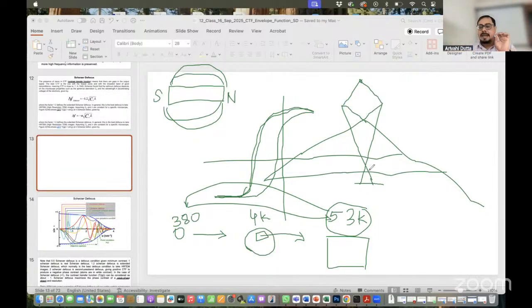Then what is happening? Your one crossover point is here. Your magnetic field is very low. Suddenly your magnetic field is very strong. Again, you are going down. So with these changes, you cannot follow the same pathway. That ferromagnet cannot behave in the same way. So what is happening? That is the lens hysteresis. Now that thing will be embedded there.